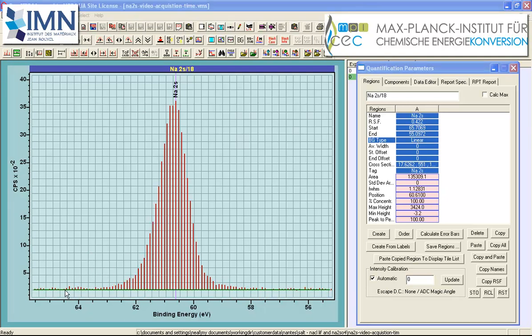By displaying the data as a set of sticks representing intensities that have been accumulated into individual data bins, you can see that effectively what we've done in measuring a spectrum is to distribute signal over an energy interval, and the consequence is that each individual data bin has fewer counts.